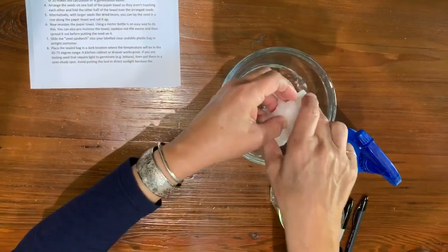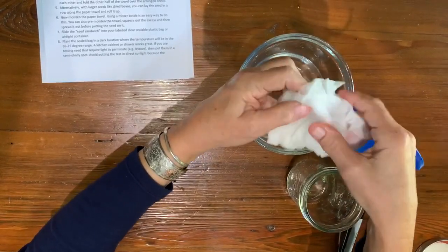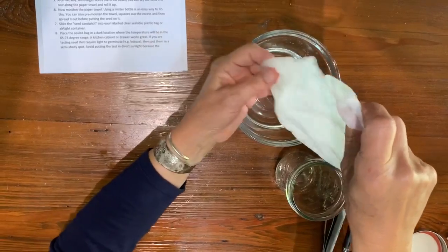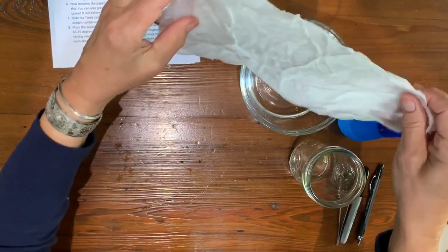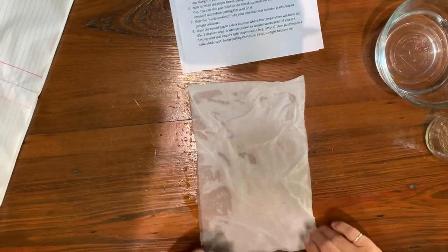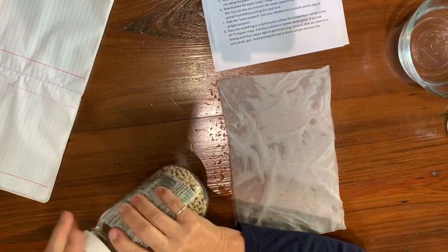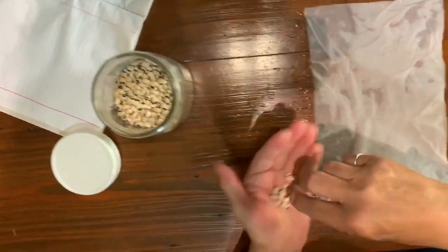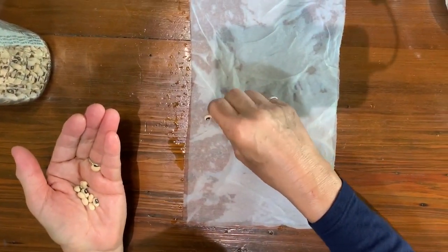Squeeze it out just to the point where it's not dripping — really wet, but not drippy. I'm going to take 10 seeds and put them in a row about halfway up the paper towel.